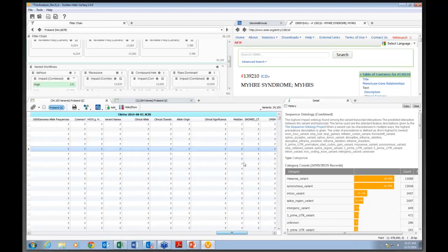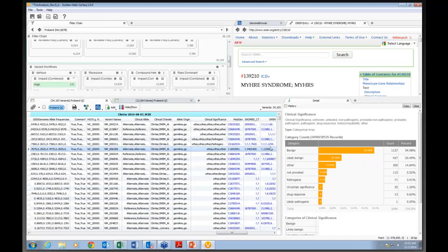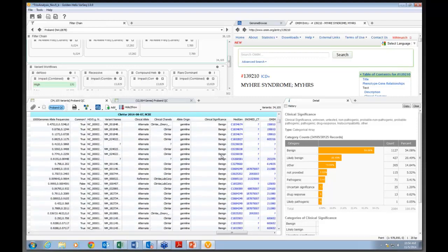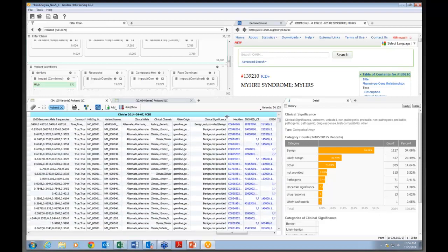If I just wanted to come over to the ClinVar clinical significance, this is one option for looking at known disease-causing variants. You might have other resources that you prefer over ClinVar, but ClinVar is at my fingertips, that's why I'm showing it. But yes, if you want to set up filters that just start from some universe of variants for a sample and look at different databases of known clinical variants, that is supported.